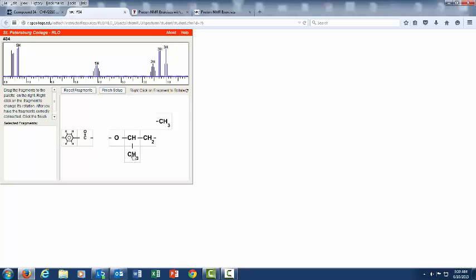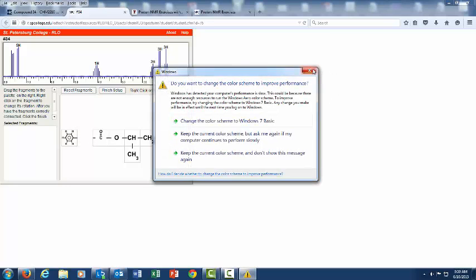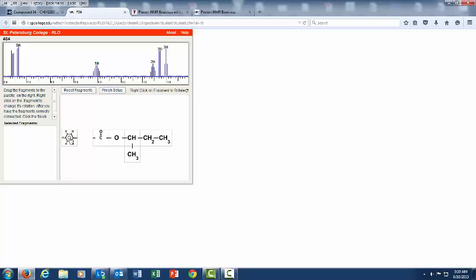You can see that we have 2 CH3s here. One CH3 has 2 peaks, is next to 1 hydrogen. That must be this one. This CH3 has 3 peaks, must be next to 2 hydrogens. So I'm going to put the CH3 group over here. I'm going to connect this to the oxygen, and this is going to be on the end. I'm going to put it on the C double bond O. Once I do this, this will come up and form the correct structure.